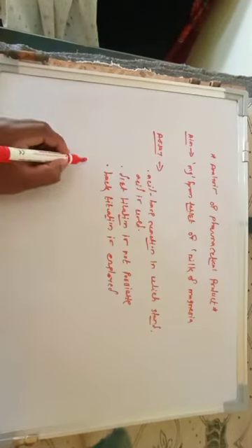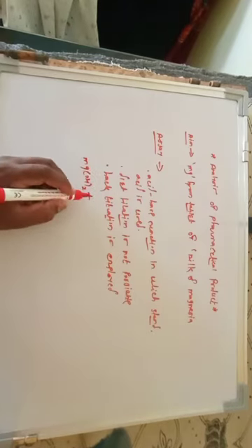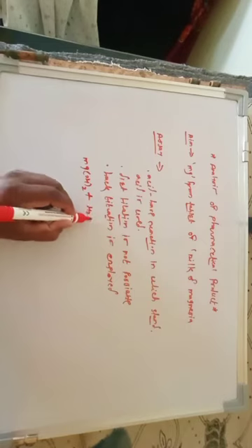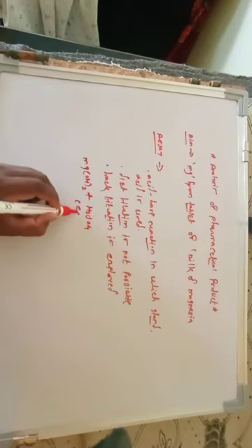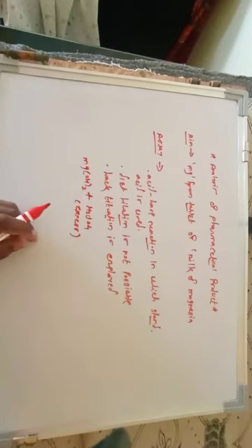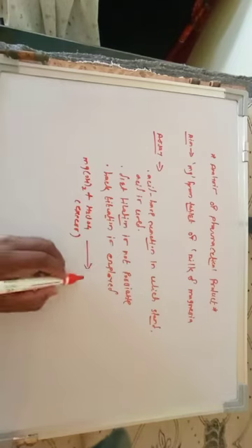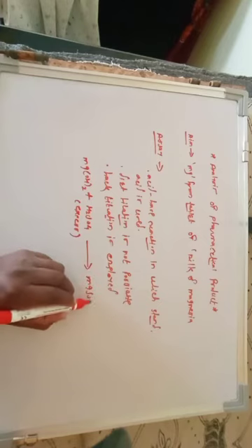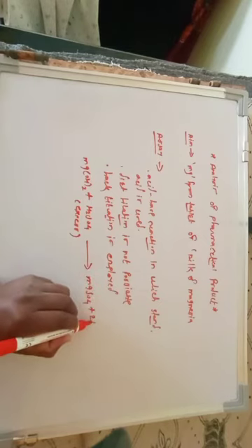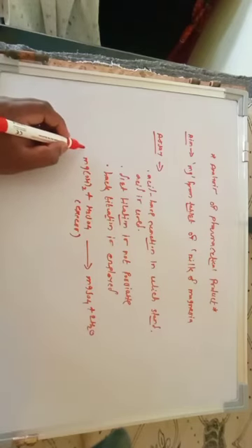If you consider the reaction, the magnesium hydroxide is dissolved in excess H2SO4. It is considered as 1 normal or 0.1 normal H2SO4. When it reacts with H2SO4, there is a formation of magnesium sulfate plus 2 water molecules. So this is the first step.